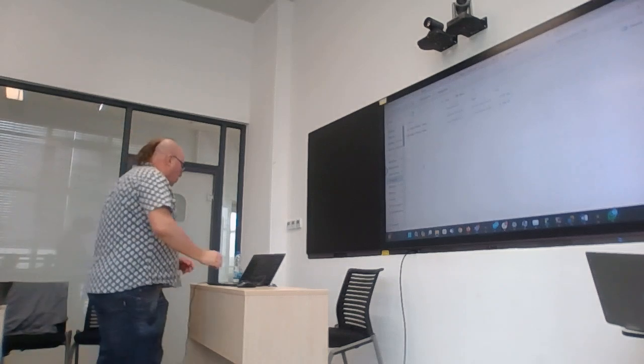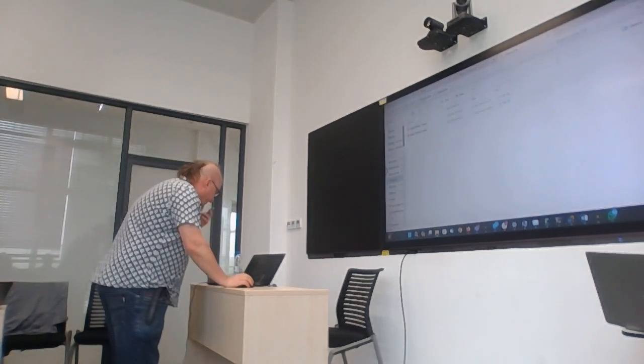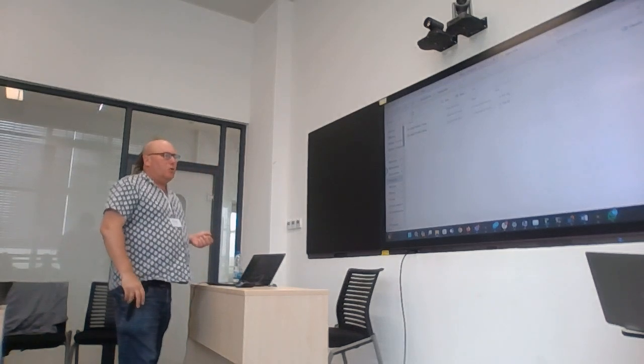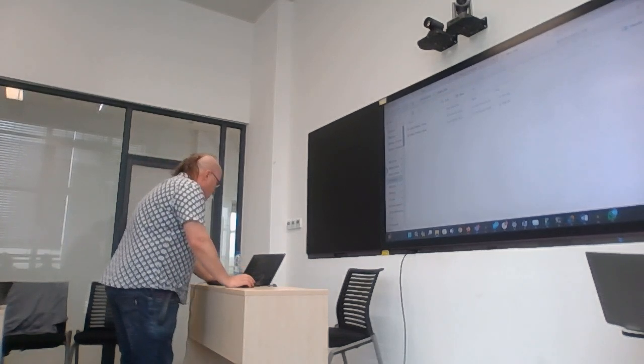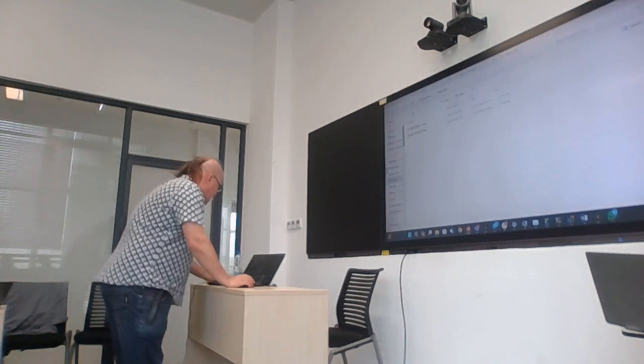To run the workflow, I need to put this on the screen. I'm going to put it in how to share this with people. Kirsty, can you paste it to the participants' WhatsApp group? That's going to make life easier, okay? What we're pasting is this.